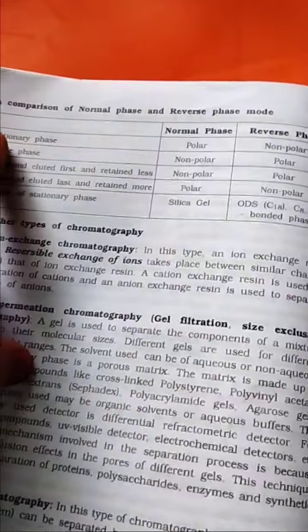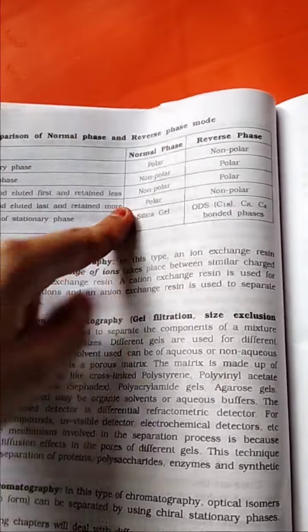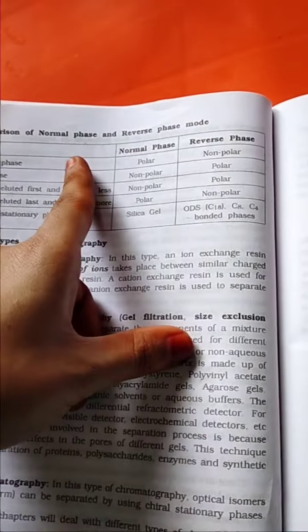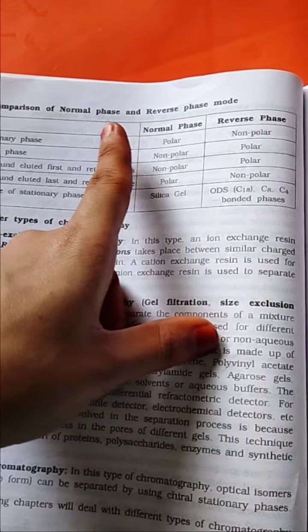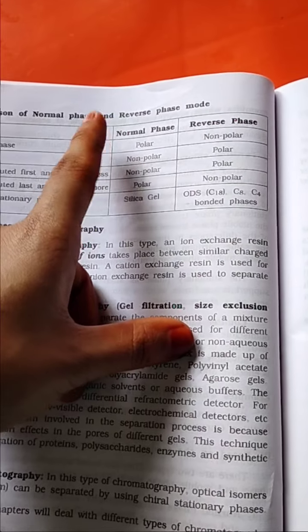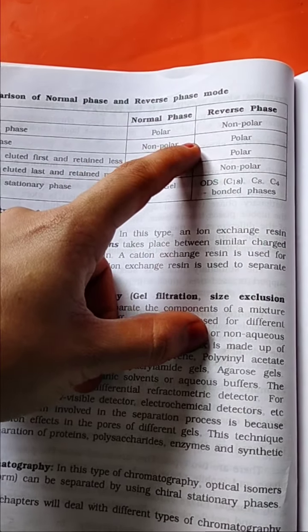Here we can compare the normal and reverse phase modes. The stationary phase in normal phase is polar and in reverse phase is non-polar. In the mobile phase, normal phase is non-polar and reverse phase is polar.